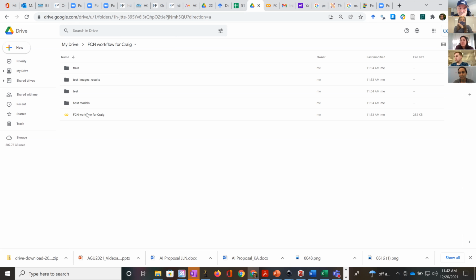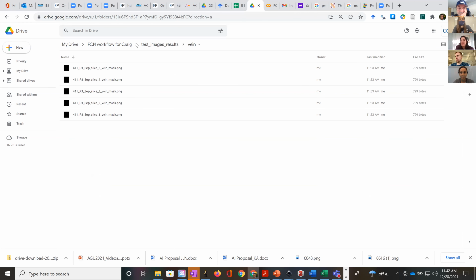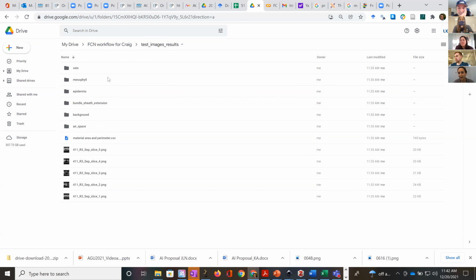And then do the manual steps for locating the stomata and then run it through random forest, because the most time consuming part for the random forest code is the auto segmentation part, which takes hours. Right. That's one option. The other option is to keep working on this method to make it happen through this method.